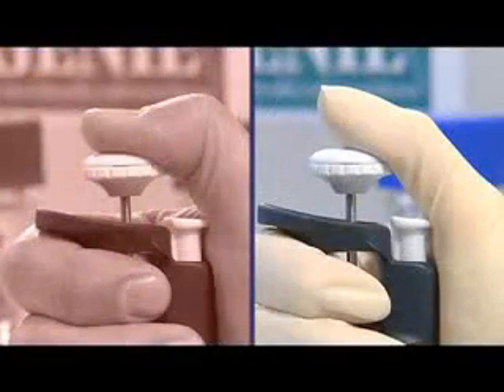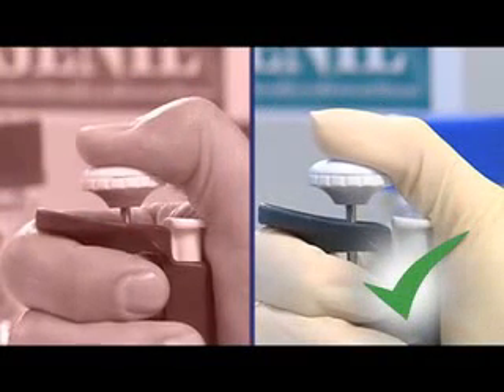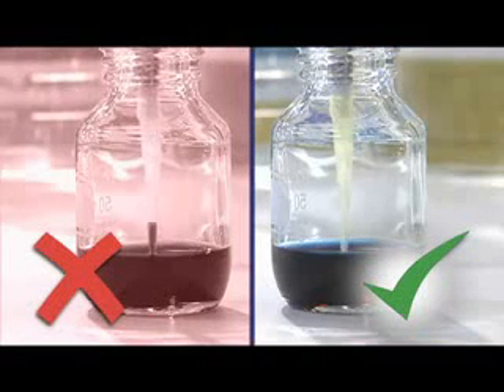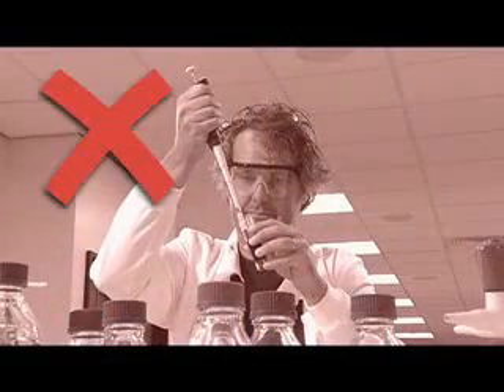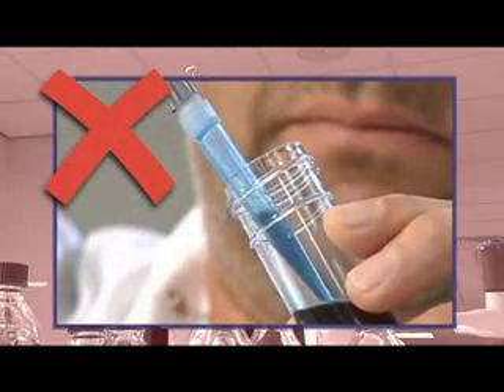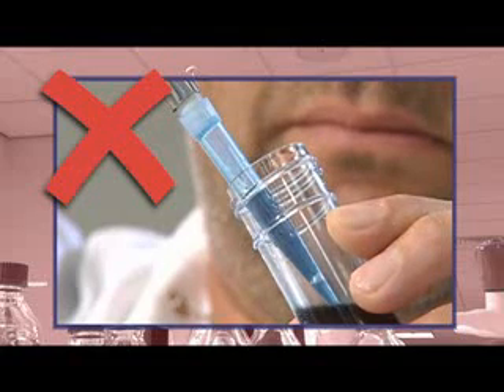When pushing down the push button to take up a set volume of liquid, don't push past the first stop. If you push past the first stop, the volume you then take up will be too large. When taking up liquids, don't simply let go of the push button. The liquid can be sprayed around the inside walls of the tip and up into the pipette body, causing inaccurate volume dispensing and pipette contamination.